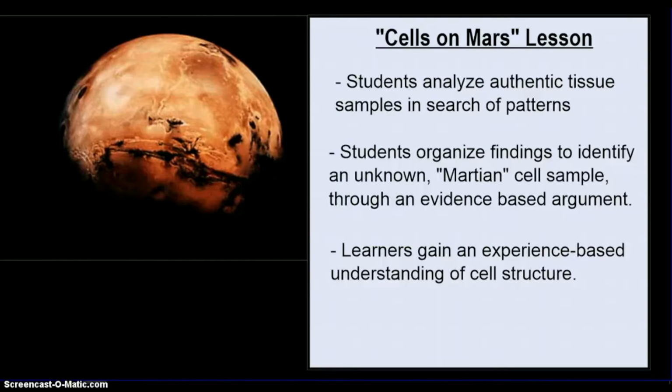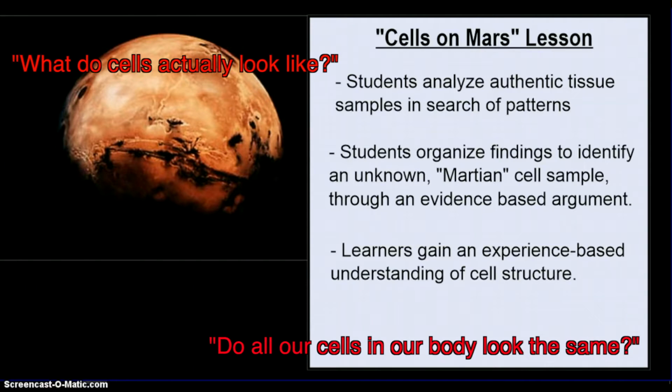I'd like to share a lesson I designed in order to improve student understanding of cell structure and to encourage learners to confidently work with technology and science tools in order to gather evidence. I ultimately wanted this lesson to address some broad questions that students commonly have when they're learning about cells. These questions include, what do cells actually look like, and do all of the cells in our body look the same?